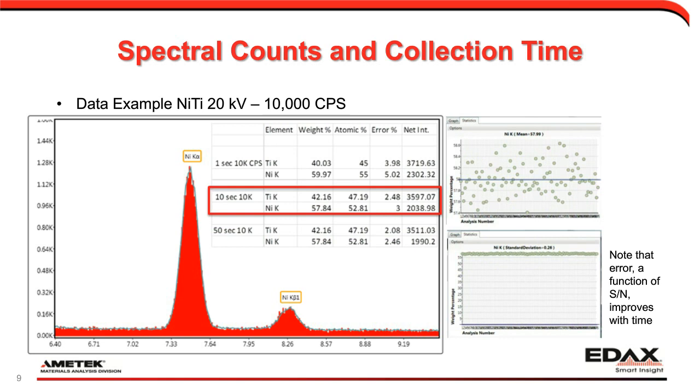Of course, if you do have a nice conductive material, like one of your metals, then you should even be able to move the microscope to a higher beam current. Microscopes are very, very good these days as far as increasing the beam current, but still keeping a small spot size. Usually they are computer controlled, or you can easily open up your aperture on the column.